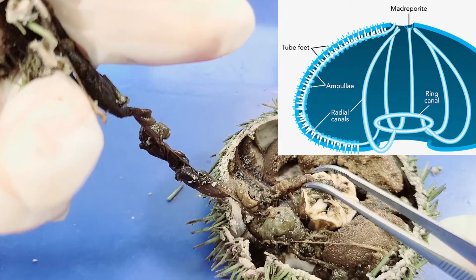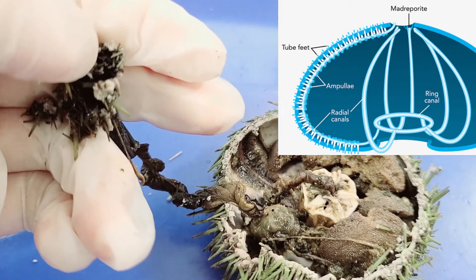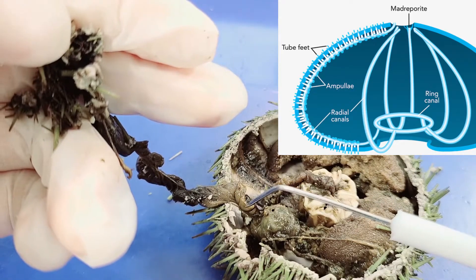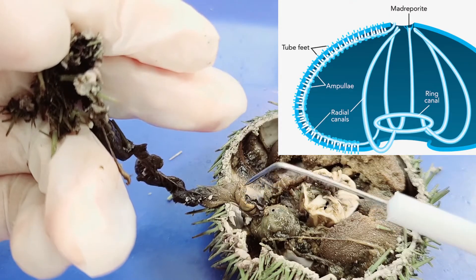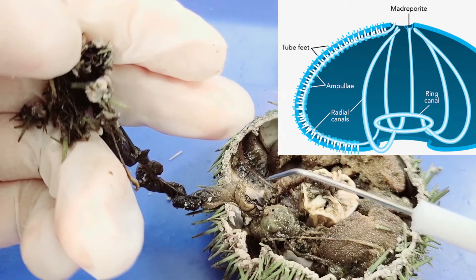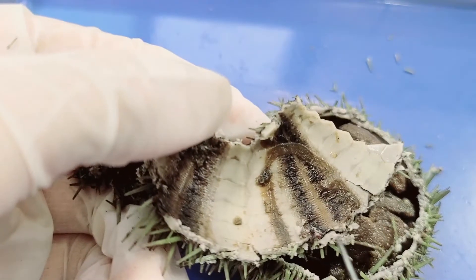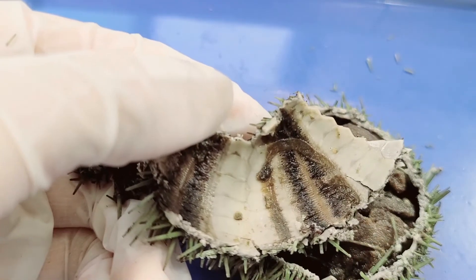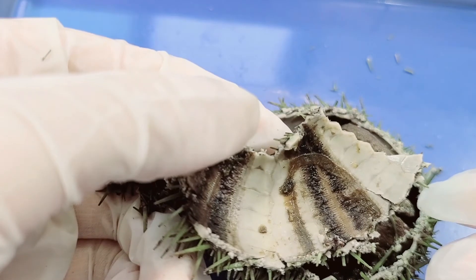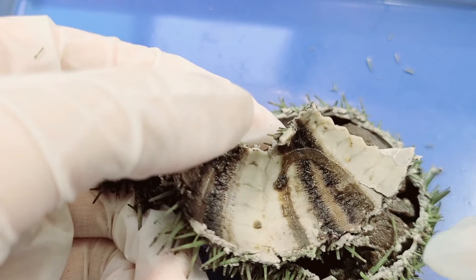From the ring canal, water goes into the five radial canals, which run up the inner wall of the test. From the radial canals, the water enters small raised structures called ampullae, which act as valves for the tube feet connected on the other side. When the ampulla is closed, water pressure causes the tube foot to extend; when open, the pressure is released and the tube foot is withdrawn. This allows the sea urchin to move around using its tube feet in a walking motion.